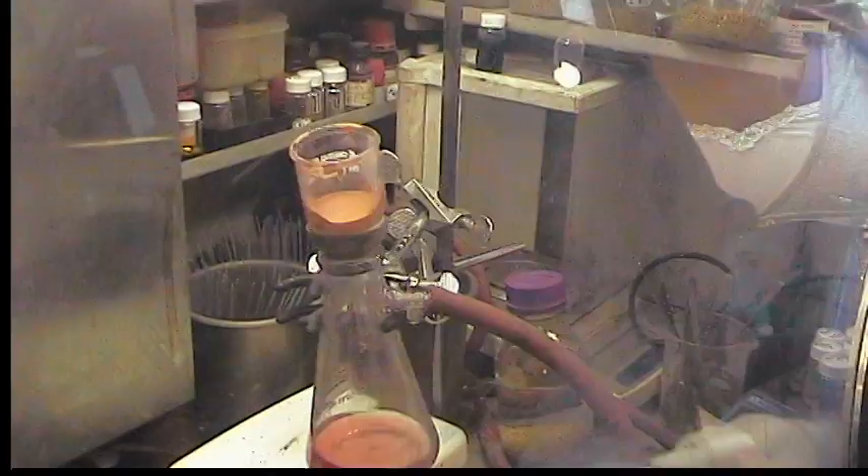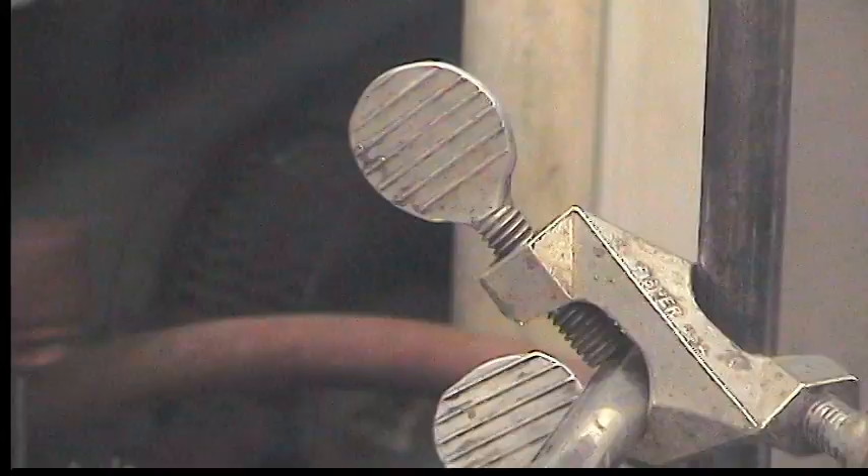And now we just need to pump the powder to dryness. We can do that in the fridge just by covering it, but it's actually more efficient to just transfer it to another filtration flask. We'll do that to save a little time.